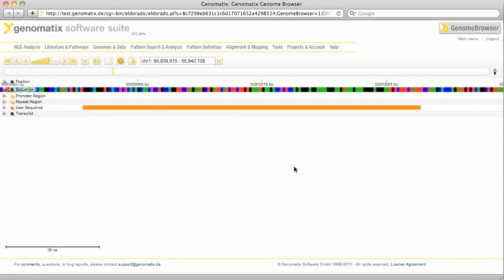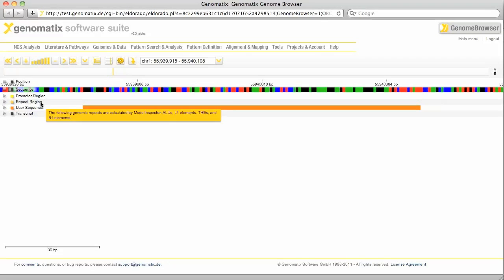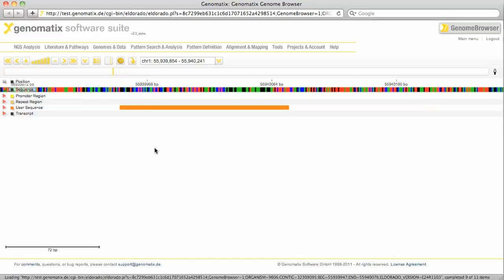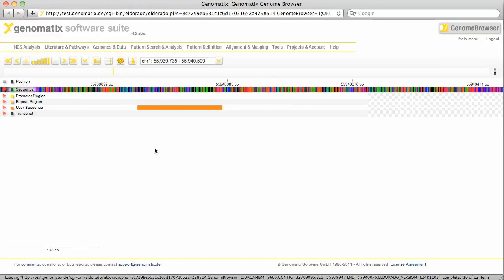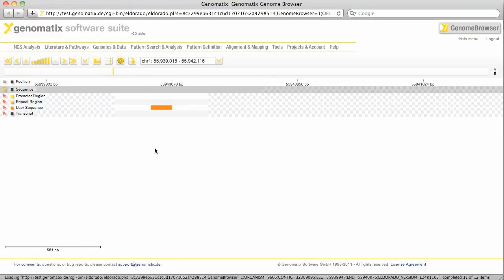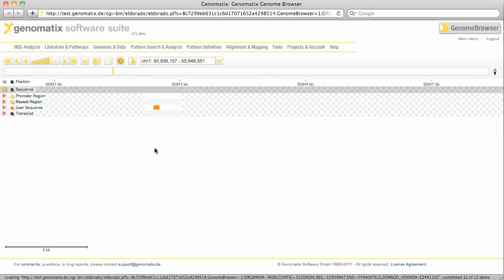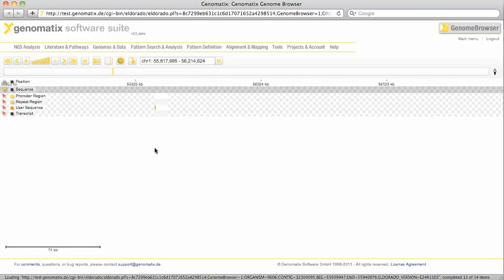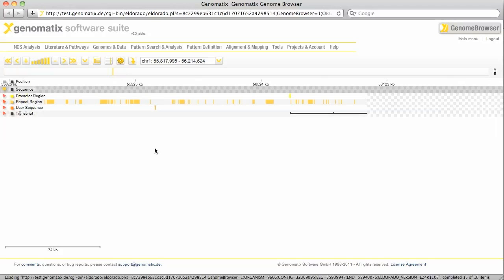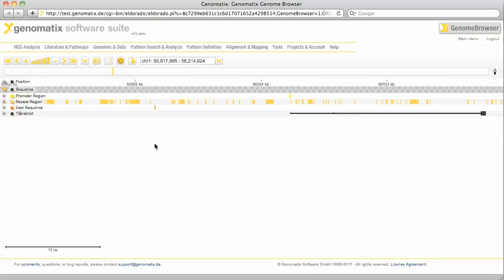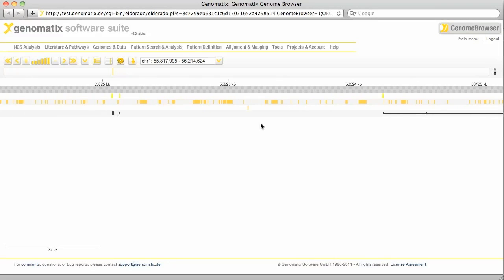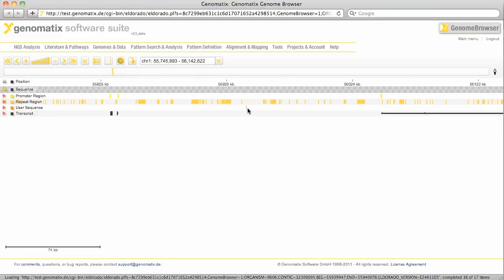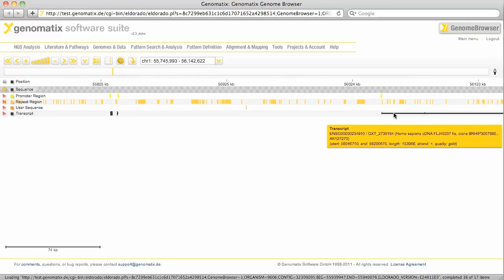Here is our region shown as user sequence in orange and we have some other annotations as well: transcripts, promoter regions, repeat regions and a color code for the sequence. We are looking at this area with a high zoom level. So let's zoom out a bit to see a larger area around the STAT binding region. We can drag our region more to the center to see the neighboring loci downstream and upstream.